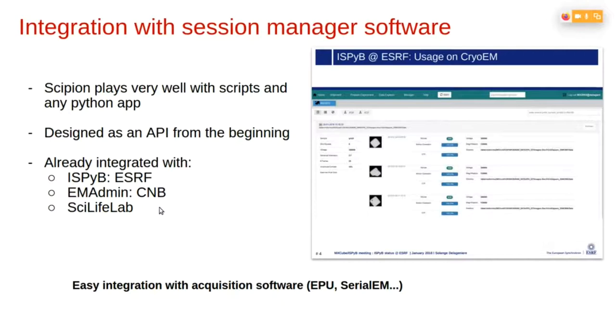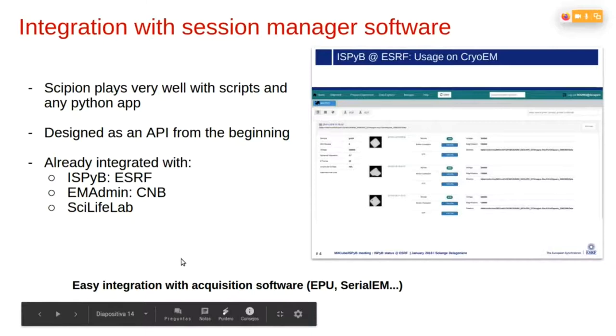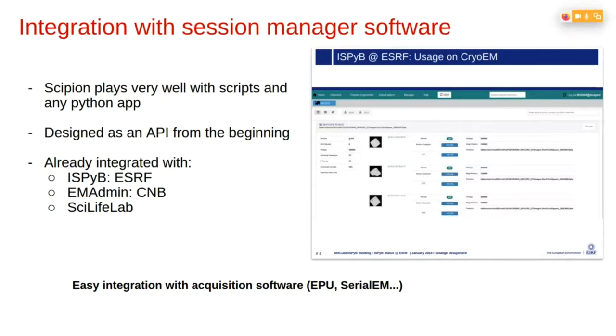And also the SciLifeLab is using their own software in order to integrate Scipion to their session manager software. Also, Scipion can be integrated or can communicate with acquisition software like EPU and SerialEM.